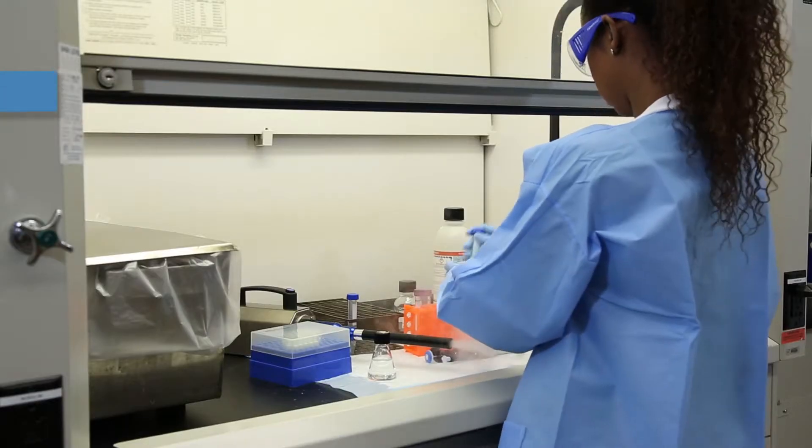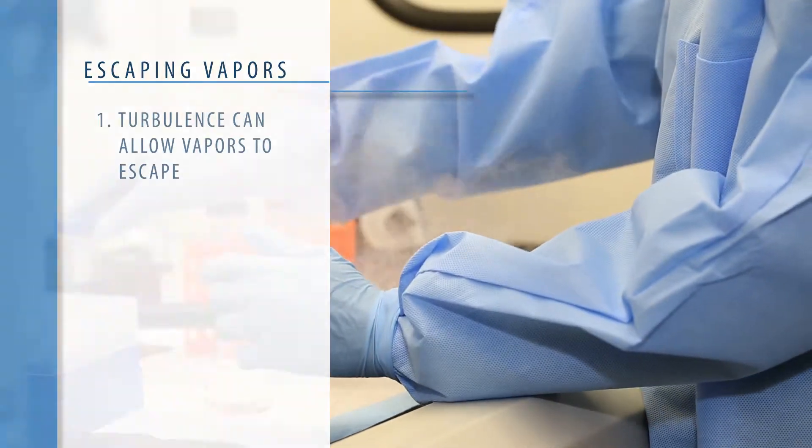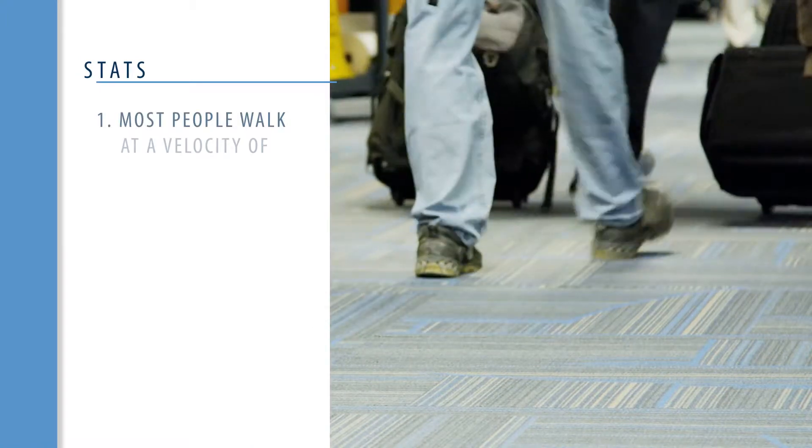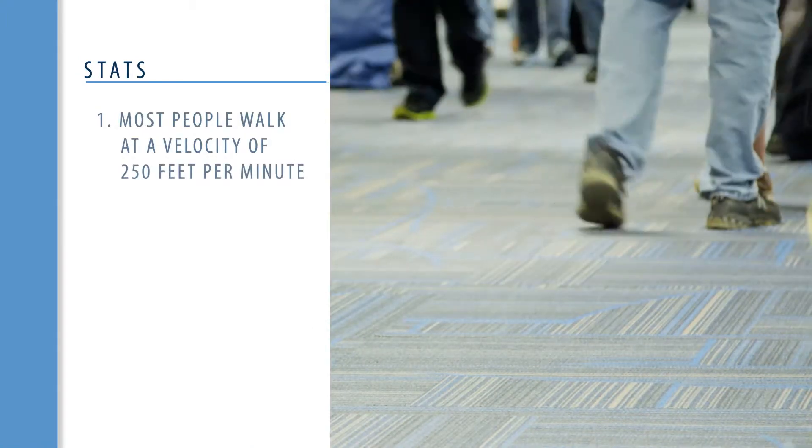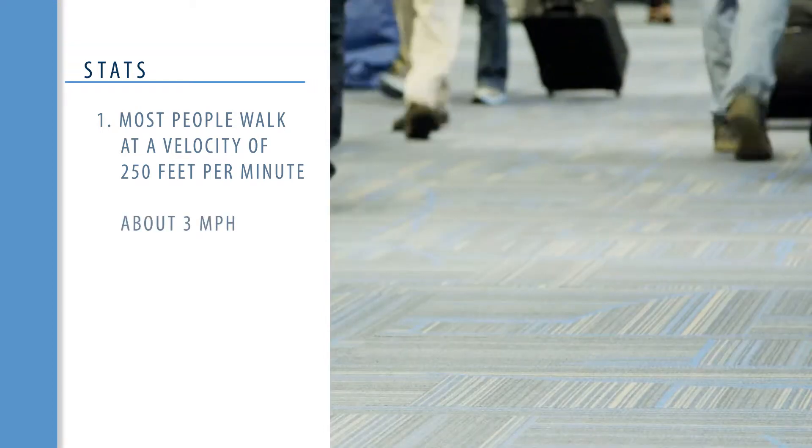Abrupt movements can cause turbulence allowing vapors to escape. For example, most people walk at a velocity of approximately 250 feet per minute, about 3 miles per hour.